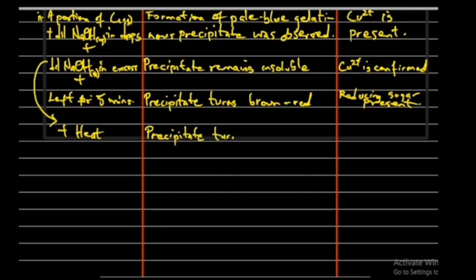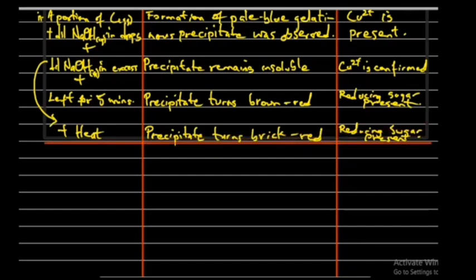So it confirms the presence of reducing sugar. That was another thing we observed while we carried out that test.